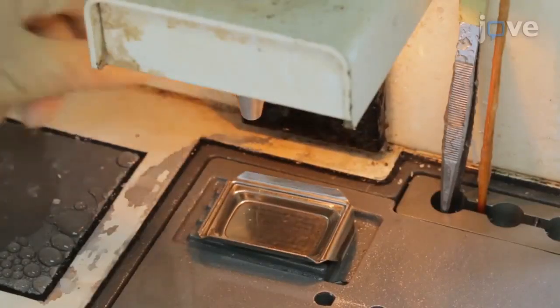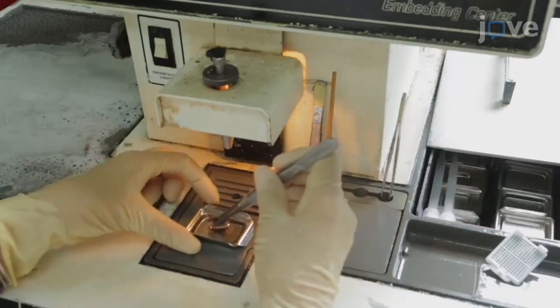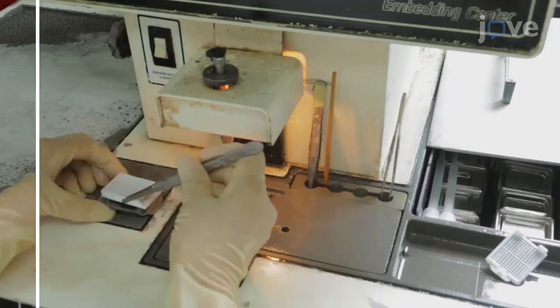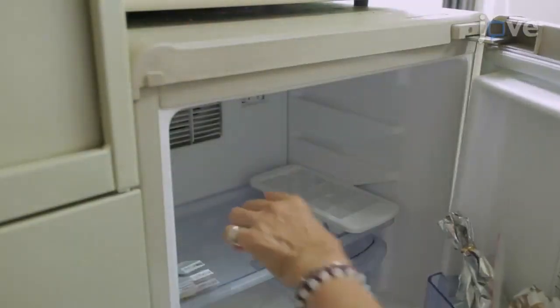After the 2-hour paraffin immersion, transfer the tissues to the bottoms of steel histology molds and embed the dehydrated tissue samples with fresh melted paraffin. Chill the formalin-fixed paraffin-embedded tissue blocks on a cold plate until the paraffin solidifies.